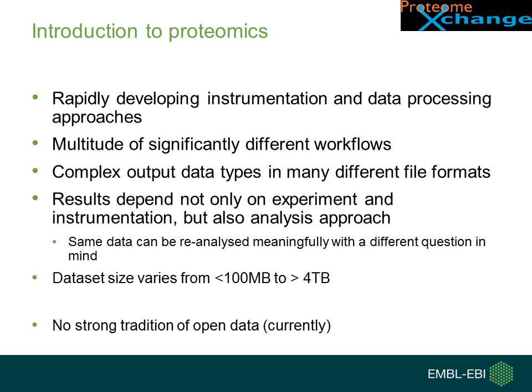And there is still a lot of experimentation, innovation, but also going out of fashion of methods. This results in a lot of complex output data types in many different file formats. We have worked a lot on standards development to try to tame this a bit and rein it in. And this has worked, I would say, with medium success. But we have definitely made a lot of progress over the last years.